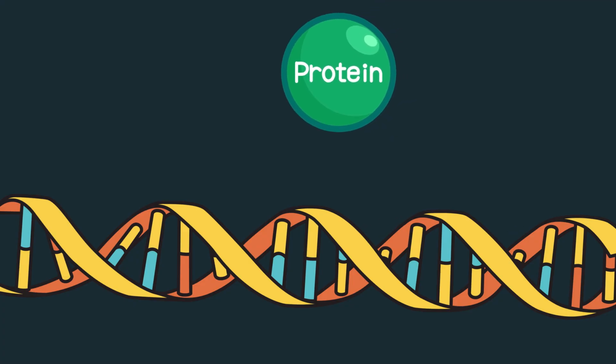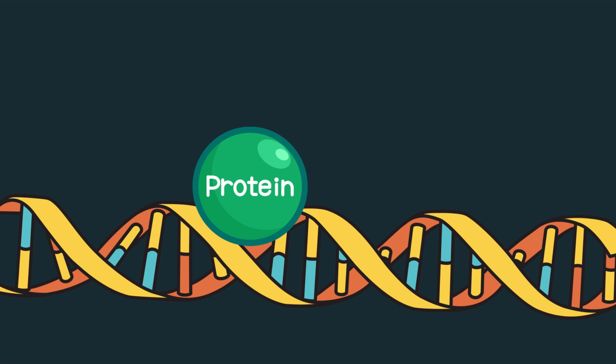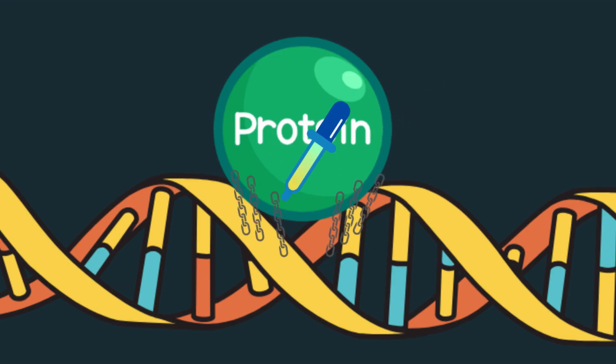With billions of base pairs in the human genome, how do we know where specific proteins bind? ChIP-seq comes to the rescue here. It's a technique that combines chromatin immunoprecipitation, or ChIP, with sequencing. Here's how it works. First, we start with cells where proteins are naturally binding to DNA. We use a chemical to freeze these interactions. This is often referred to as cross-linking. It's like capturing a moment in a picture, ensuring that everyone stays in place.